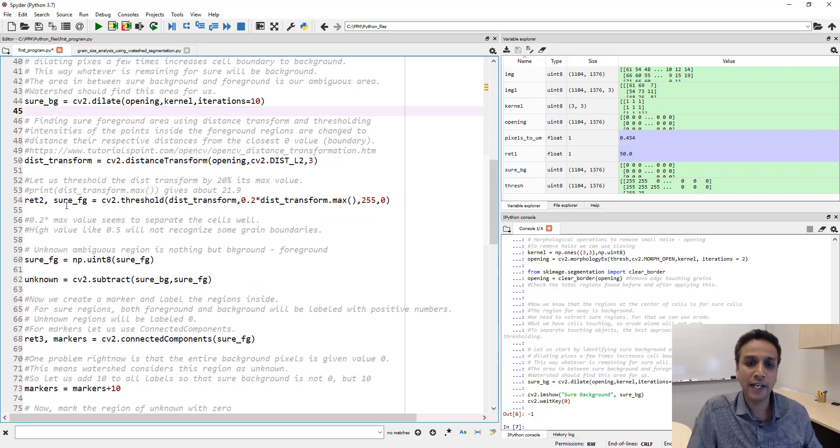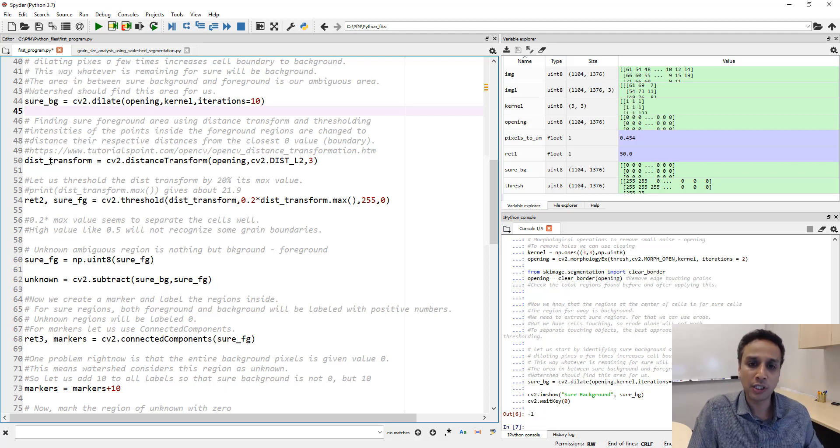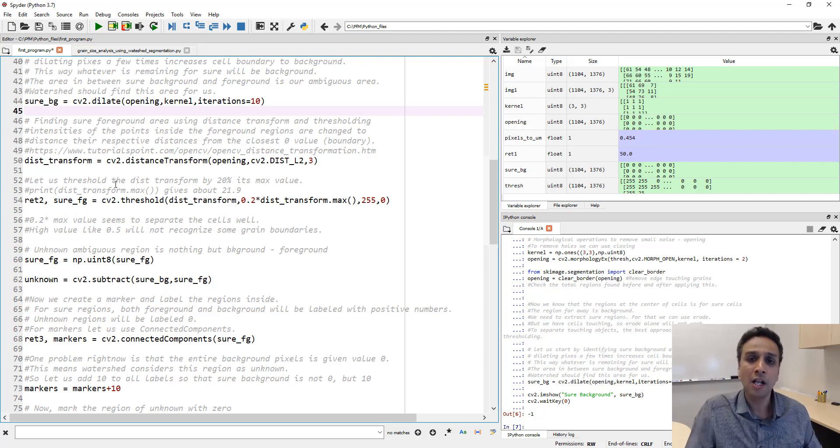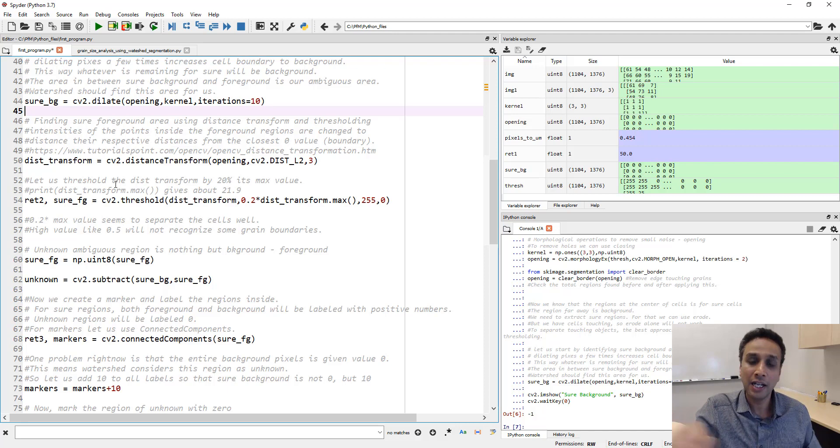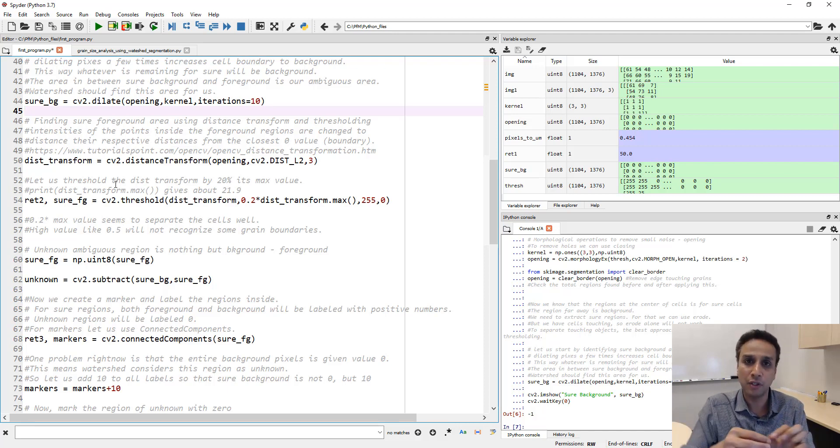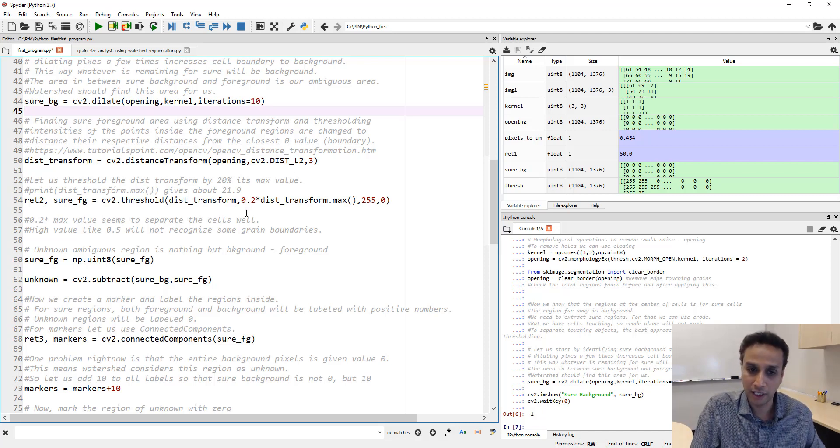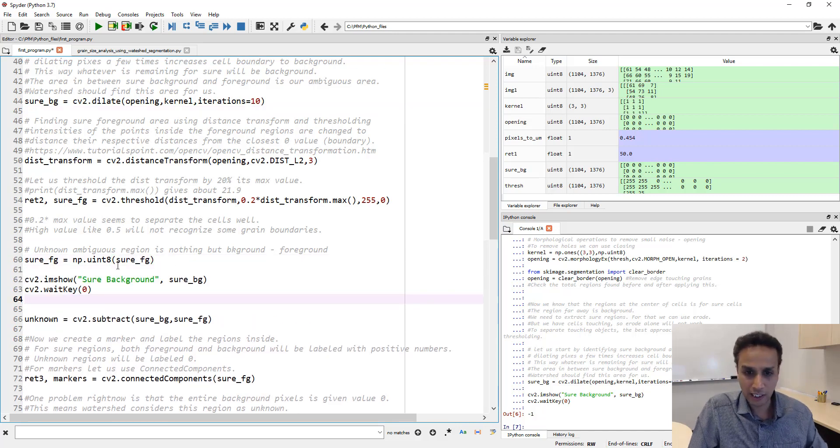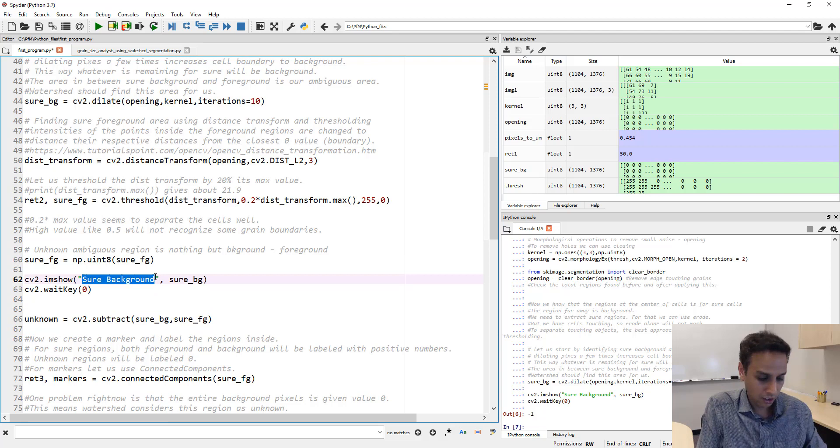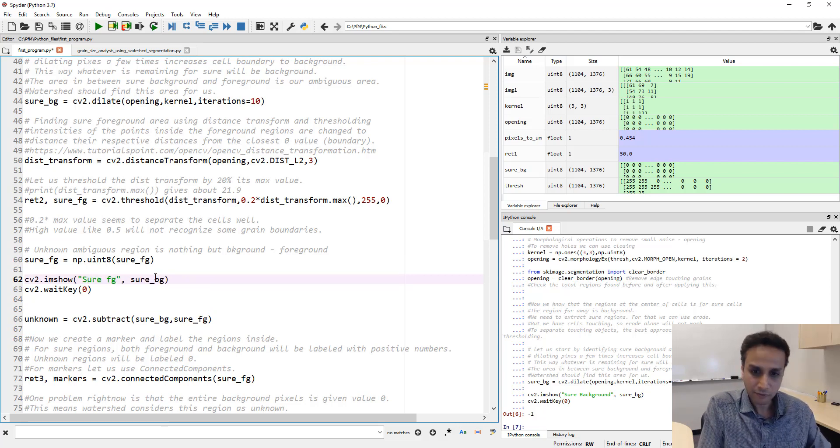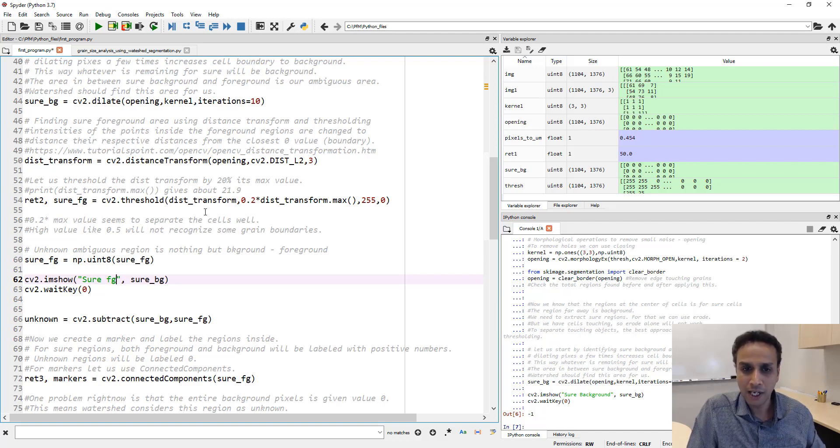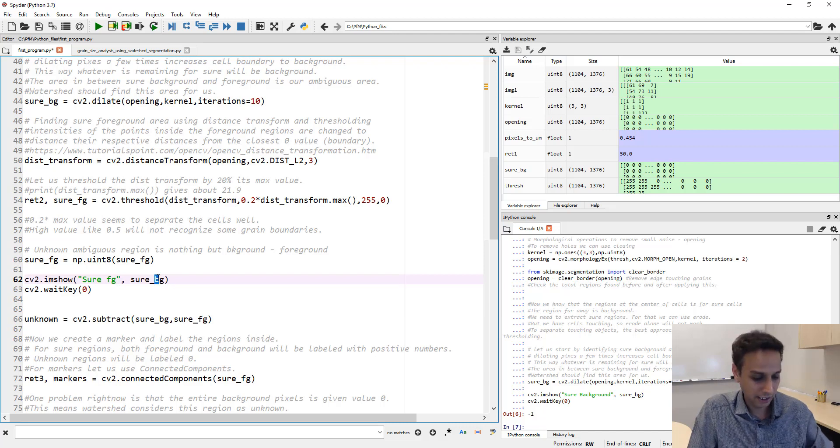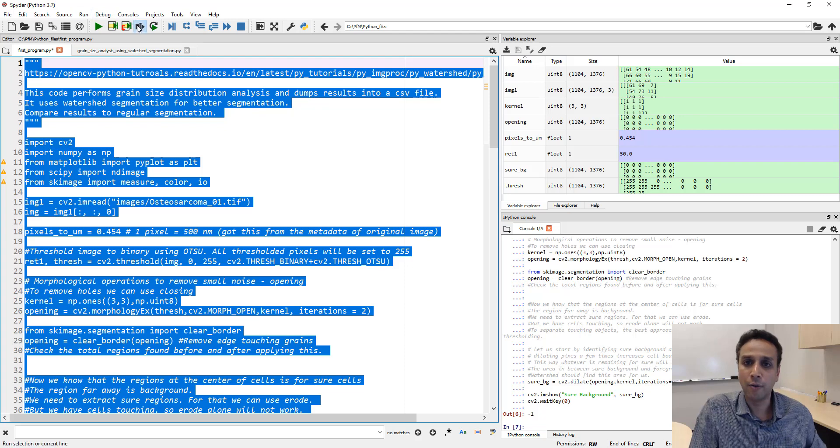The next task is to find out the pixels corresponding definitely to the foreground. For that we use distance transform. Distance transform is nothing but from a given pixel what is the distance to the closest zero or the closest black pixel. The center of the cell would have a very high value because the distance is very long from the center to the boundary. The boundary pixels will have a low value, that's why we need to threshold it accordingly. Let's print out exactly how this image looks like, this is our sure foreground image. I'm taking this distance transform and I am thresholding it to certain value and that's what I'm assigning to sure foreground.